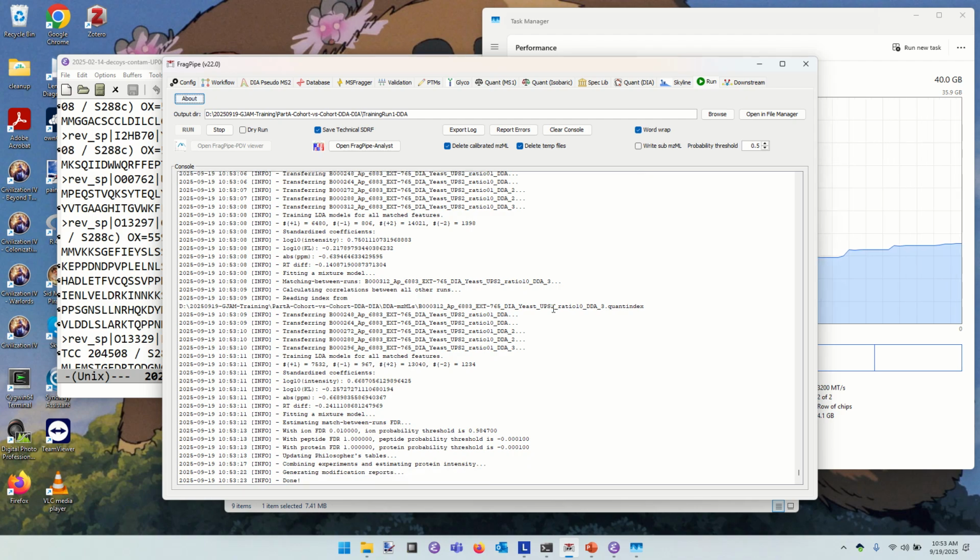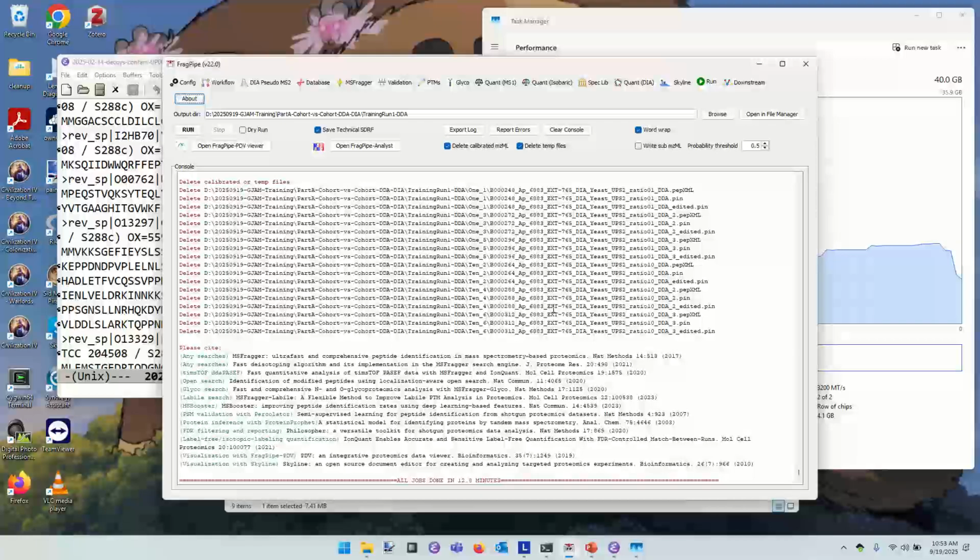I have to say this is a very big change from the way that protein identification worked when I was in grad school. Does anyone here remember a Pentium Pro? Yes, we had a Pentium Pro, I think at 200 megahertz under Jimmy Eng's desk. And we ran Sequest compiled for Windows on that machine for dealing with all of our data sets.